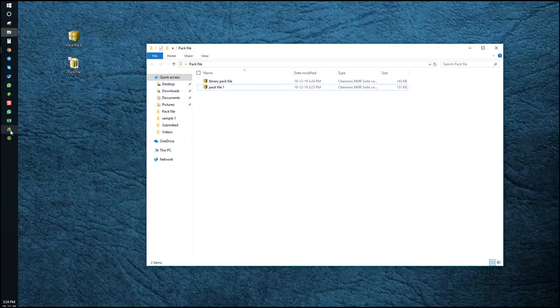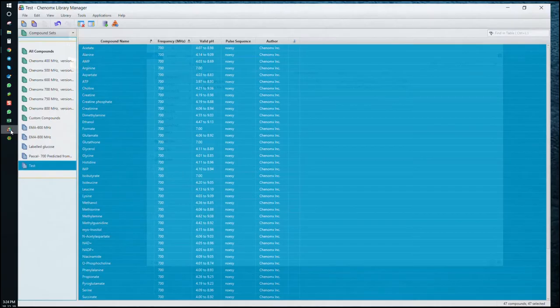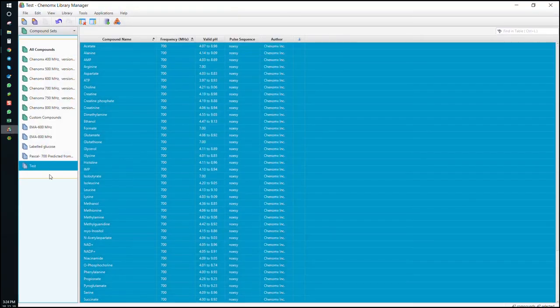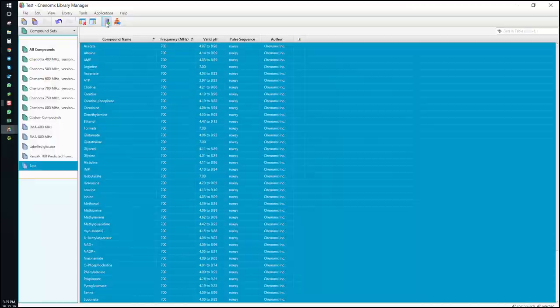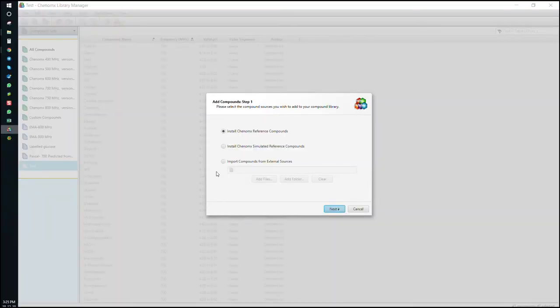Let's go back to the library manager and try clicking this button here. Add compounds. Then import compounds from external source and choose your PAC file.